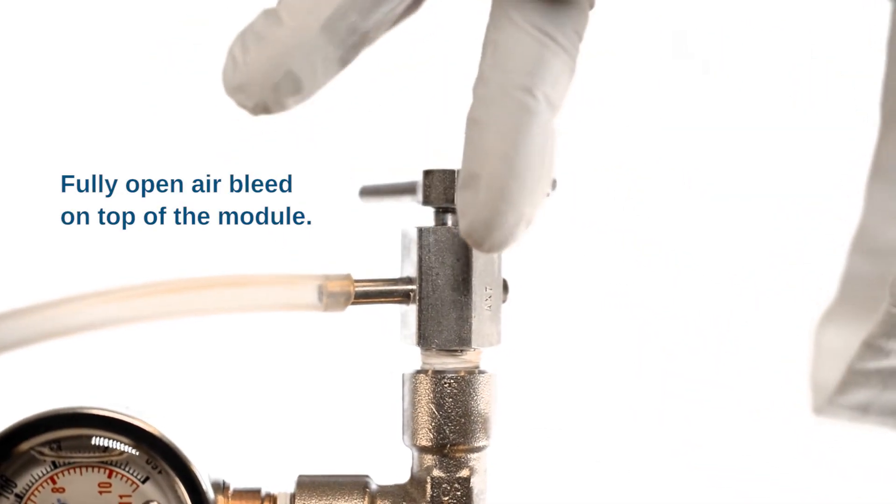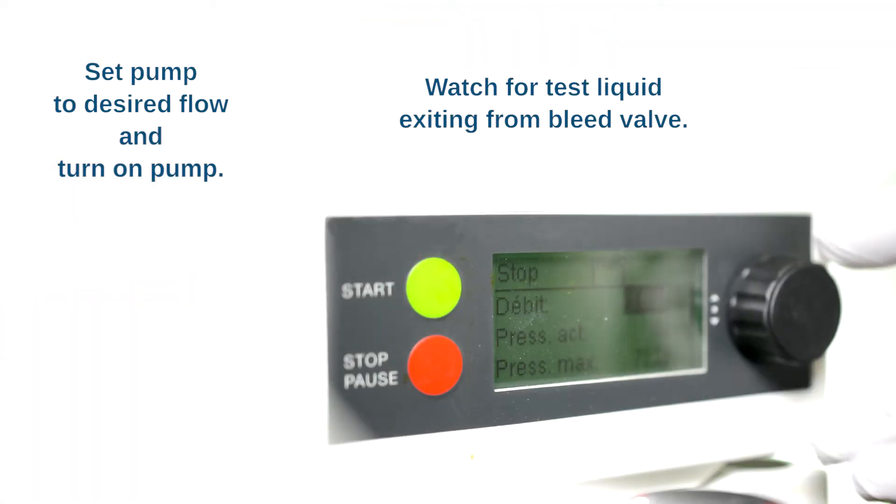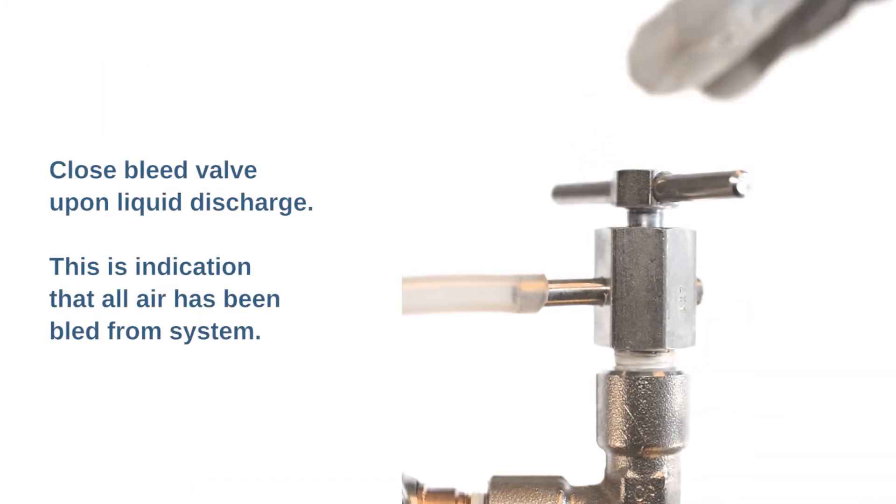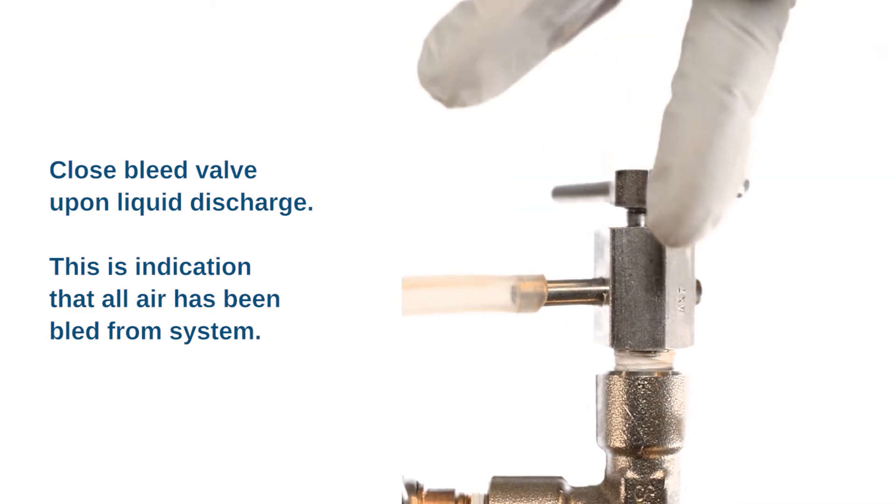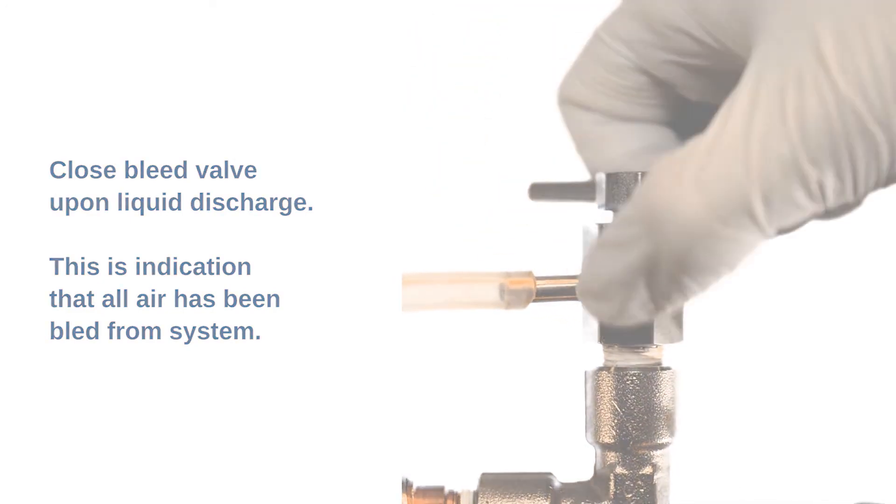Fully open air bleed on top of the module. Set pump to desired flow and turn on pump. Watch for test liquid exiting from bleed valve. Close bleed valve upon liquid discharge. This is indication that all air has been bled from system.